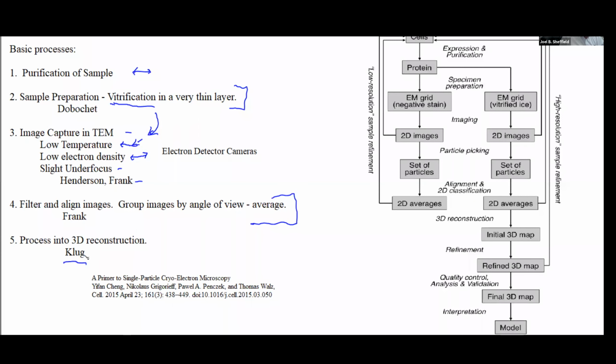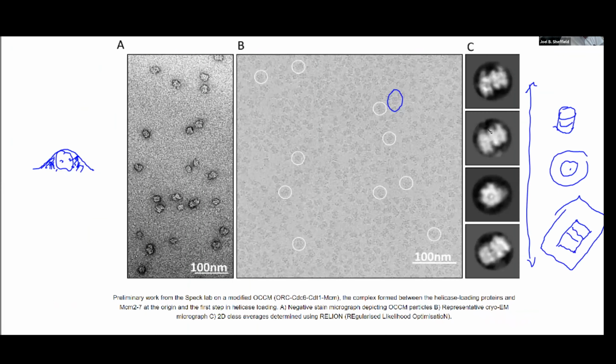That is the theory of tilting the sample, of assuming that when you have this set of images, it does represent in a certain way a family of molecules tipped in different directions. And so you can consider that if you now run your computer system to say, these are at different angles, let's now assume that they're all of the same structure and assemble this into a 3D molecule. So that was the basic idea of this process.